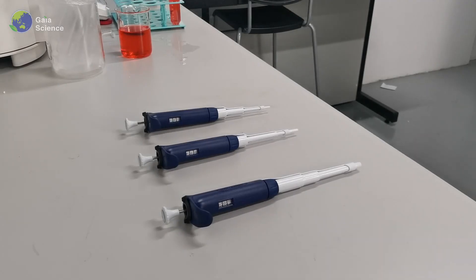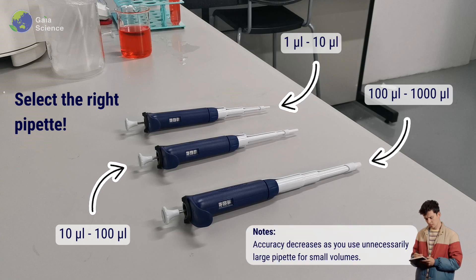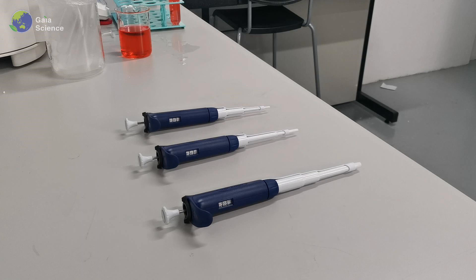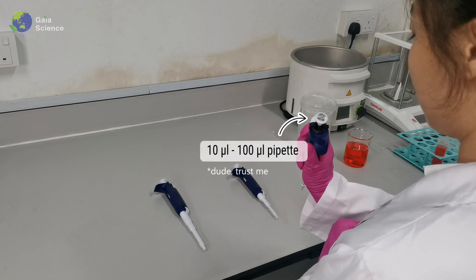Firstly, you need to determine what size of the micro pipet fits your job. Always select the smallest size pipet that can handle the volume you wish to move. Accuracy decreases as you use an unnecessarily large pipet for small volumes. For example, if you want to dispense 100 microliters of liquid, you should select the pipet with a volume range between 10 to 100 microliters.